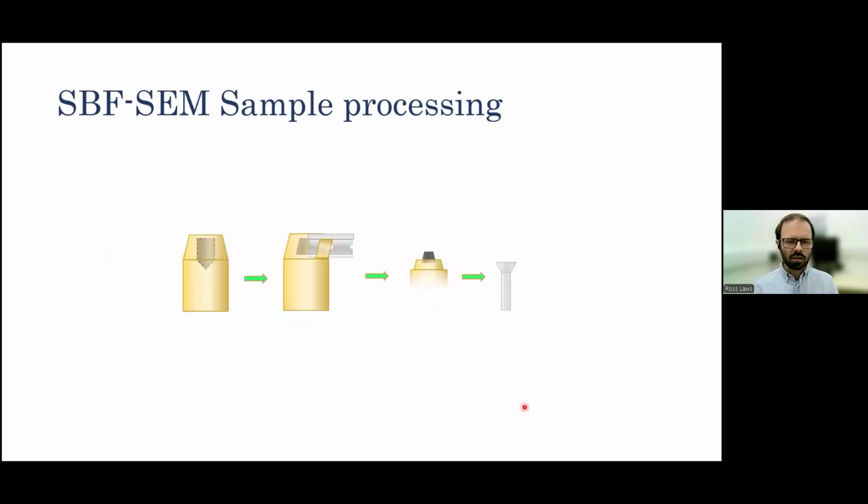When you've done that and polymerized your sample in resin, you have to cut it out of the resin and basically unearth it again. And then you take the fully polymerized sample and cut it off from the resin and mount it onto an aluminium pin. So the sample at this point is completely solid in the resin once it's polymerized. So all the way through, it's not just enrobed in it, it's actually penetrated into the tissue.